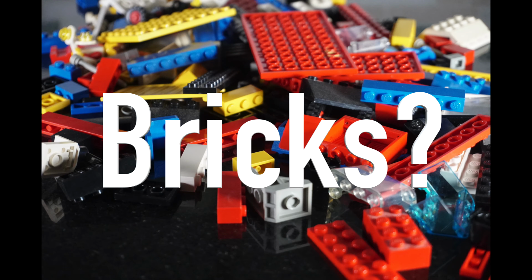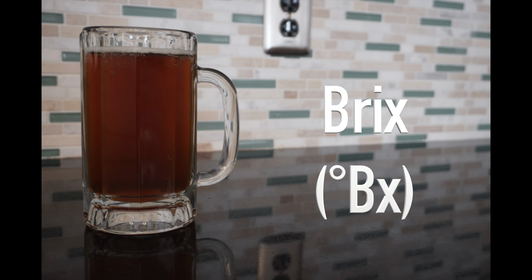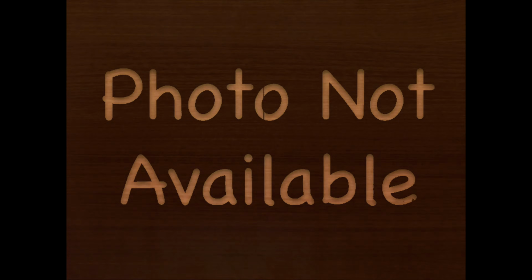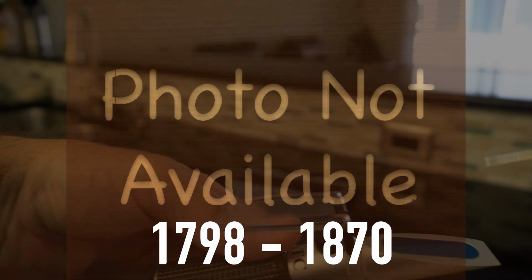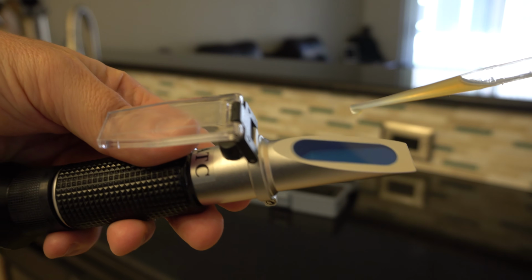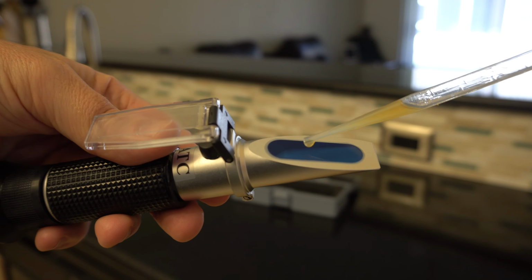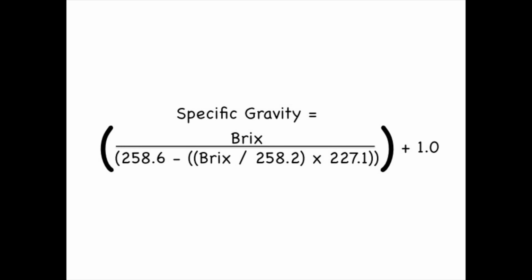So what is Brix? Brix is a measure of the liquid's sugar content, with 1 degree of Brix equivalent to a 1% sucrose solution as a percentage of mass. Also, Brix is named after Adolf Ferdinand Wenceslaus Brix, who is apparently dead. To use it, place a couple of drops on the prism, hold it up to the light, and read the Brix value. Also, be sure to take the initial and final refractometer readings at the same temperature, because apparently that matters. Now that we have our Brix value, we'll need to do some arithmetic to convert it to specific gravity.